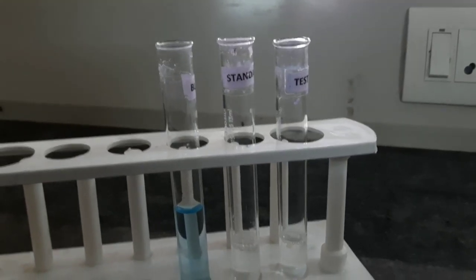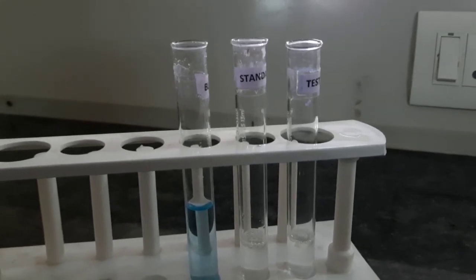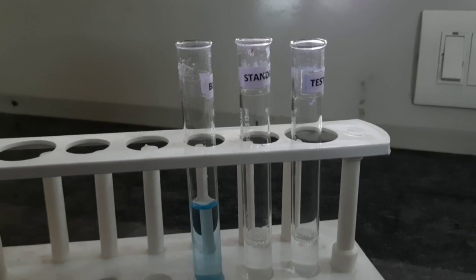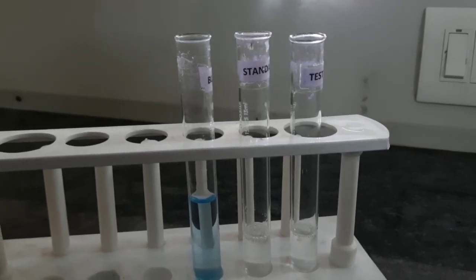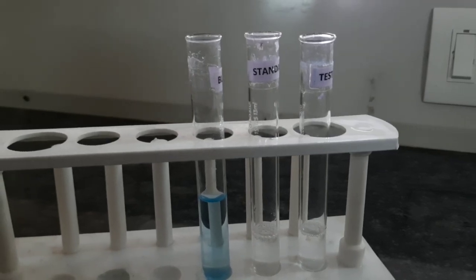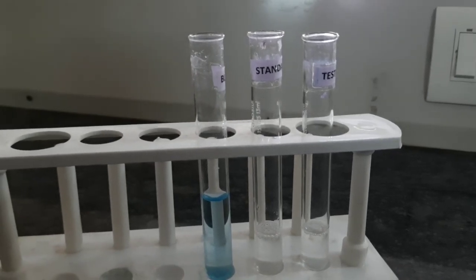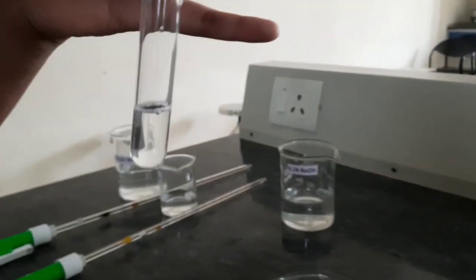Now we are going to take the test sample. As you all know, we have dissolved the pellet in 0.5 ml of NaOH and 2.5 ml of water, and our test sample is ready. To this test sample, we should add 3 ml of biuret reagent. So we are going to add 3 ml of biuret reagent to the test.